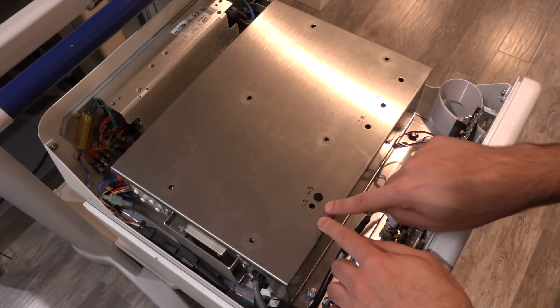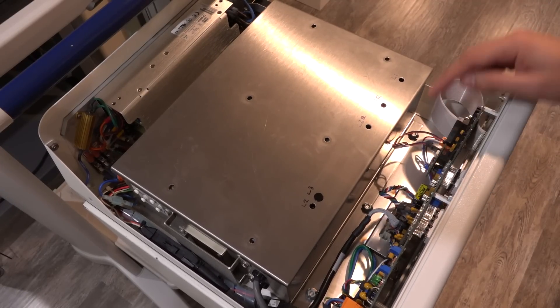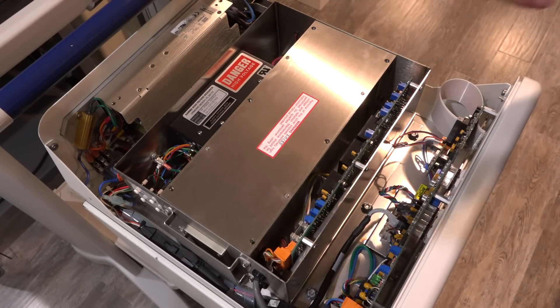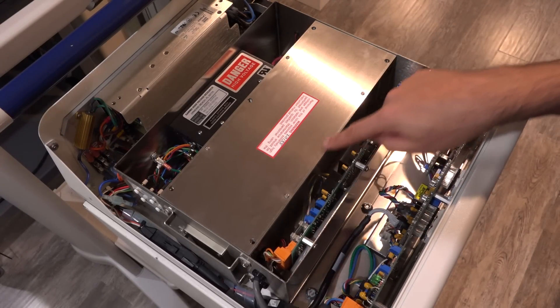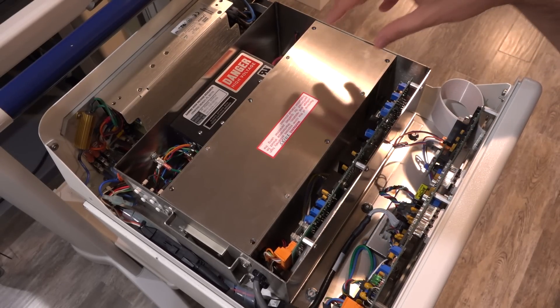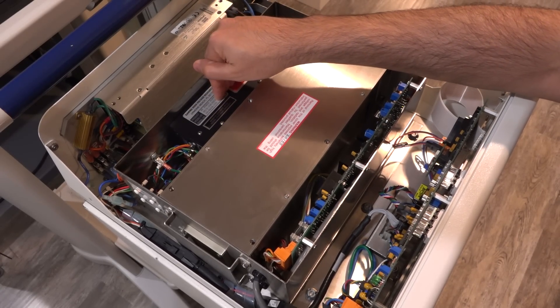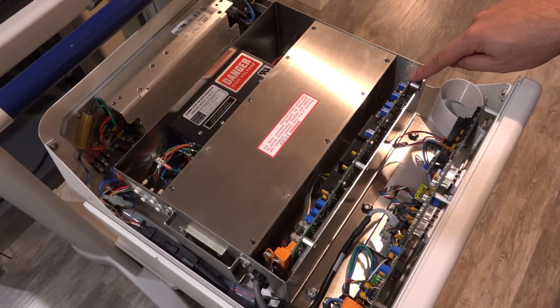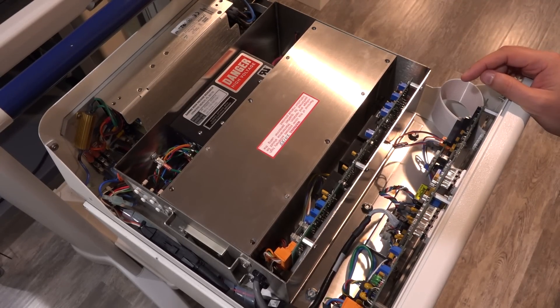I've already removed some screws and labeled the holes. Removing this panel — it's a fairly heavy, thick piece of metal — is important because this cage is what protects against stray X-rays from the tube. There are multiple levels of protection here. Removing this top panel means you really shouldn't run the tube, as it will emit X-ray from the top of the unit. The high voltage power supply is over here, with a cable controlling everything. The problem is most likely on this board, which directly interfaces with the X-ray tube.